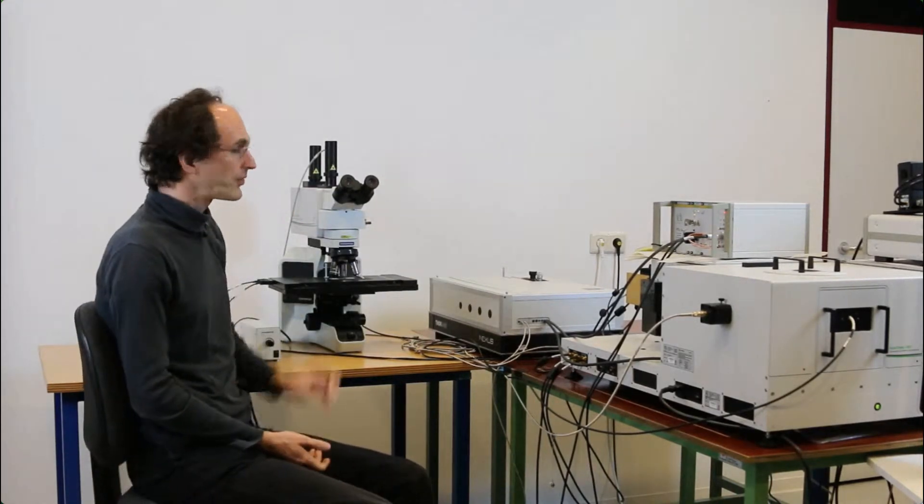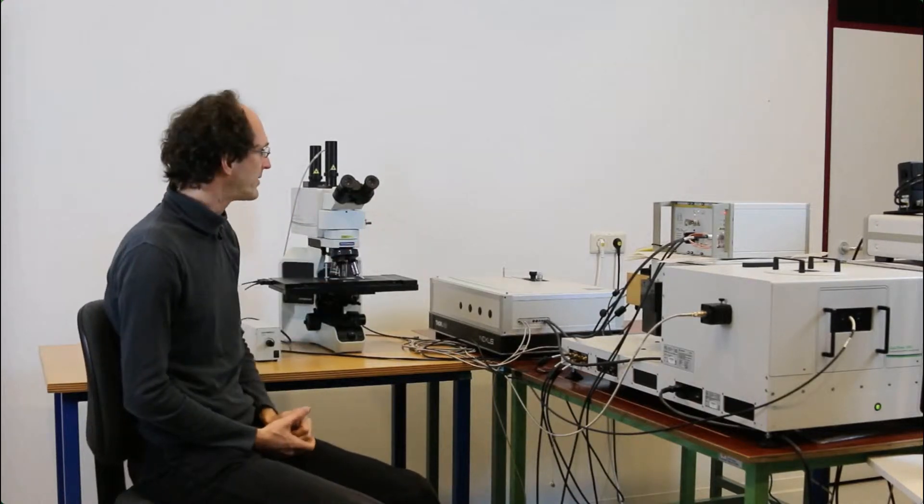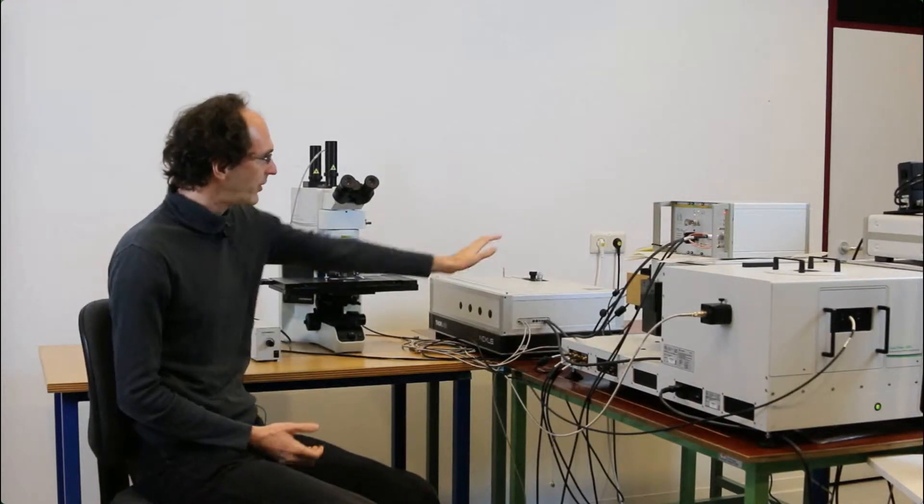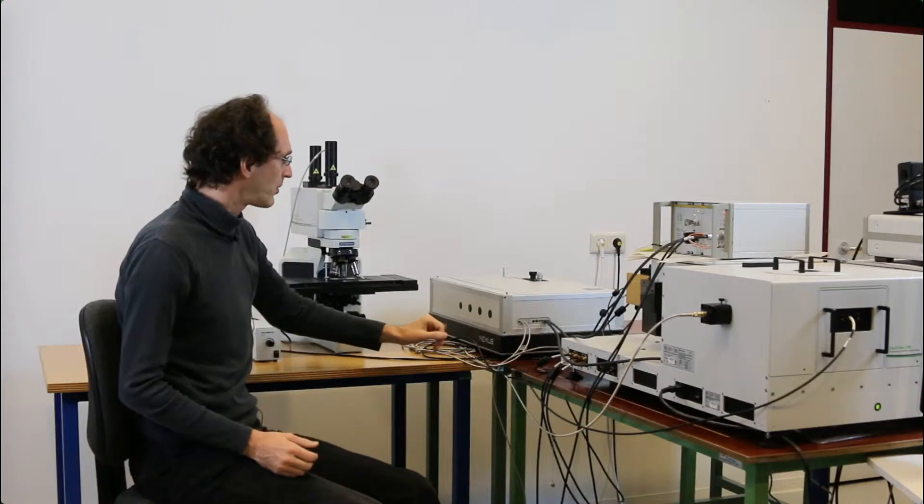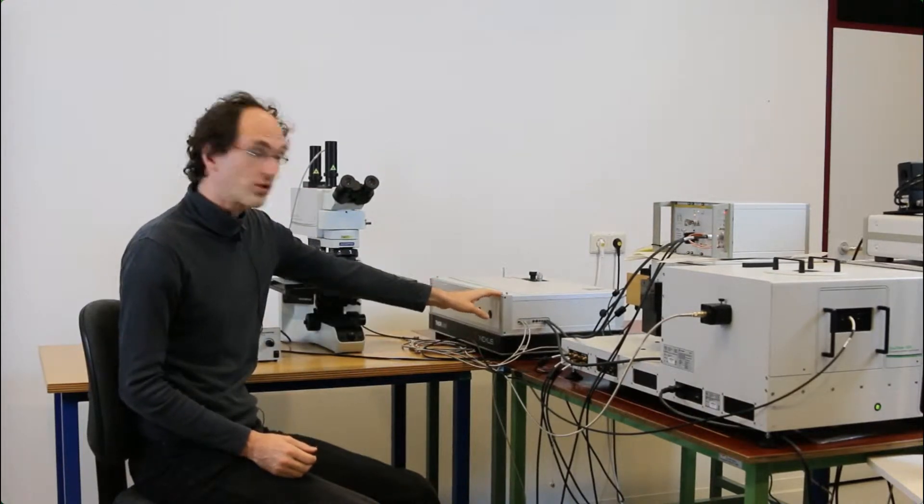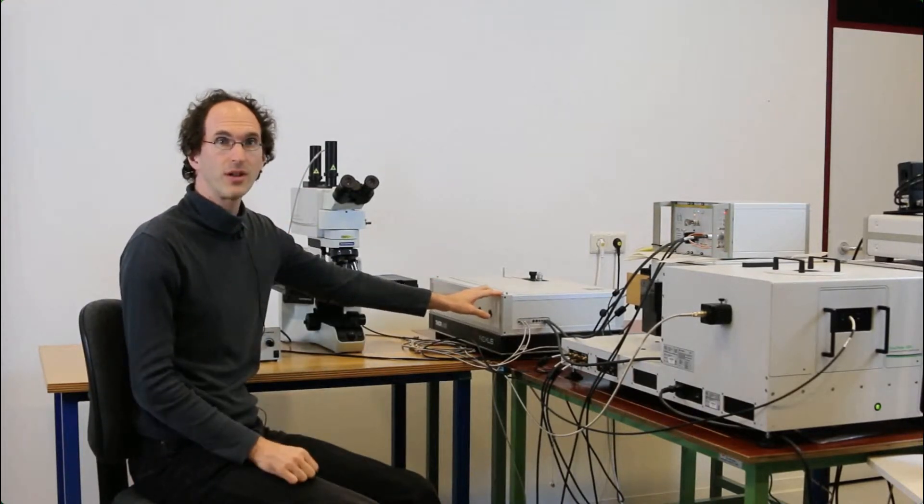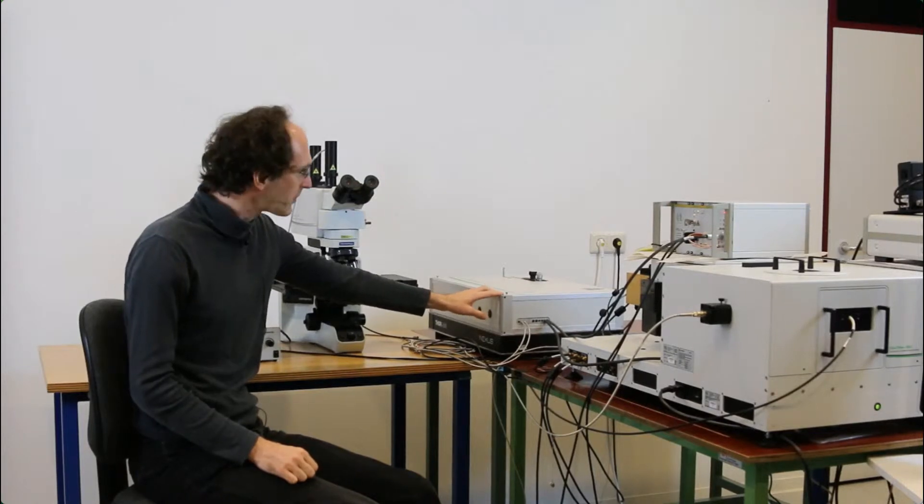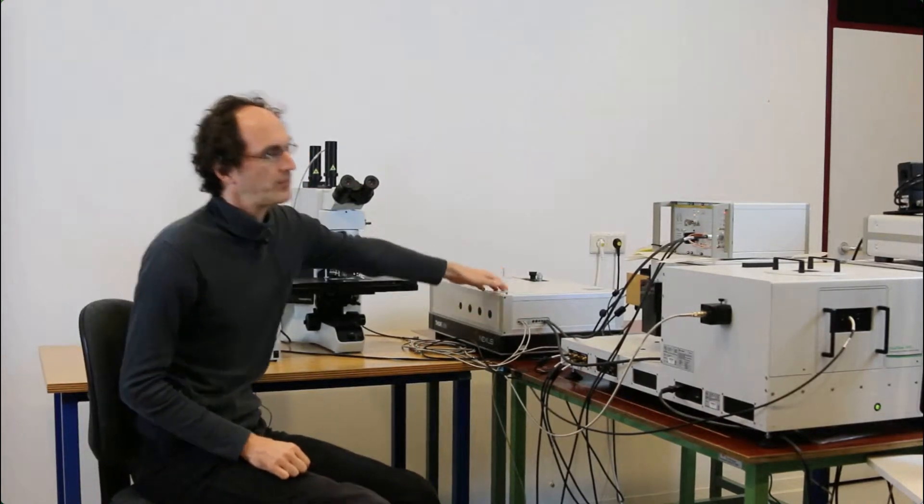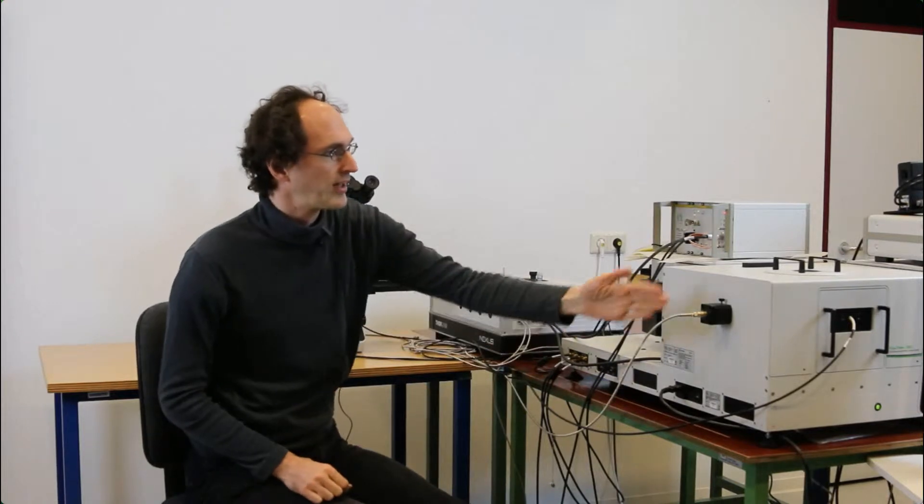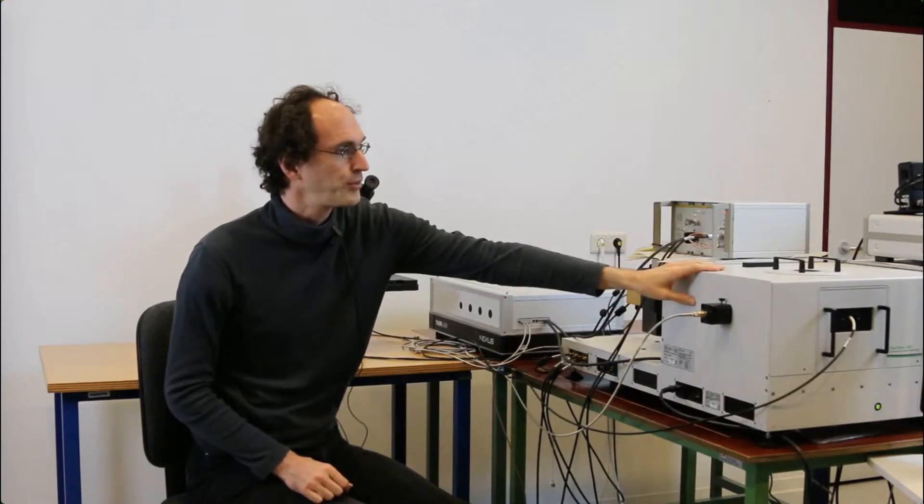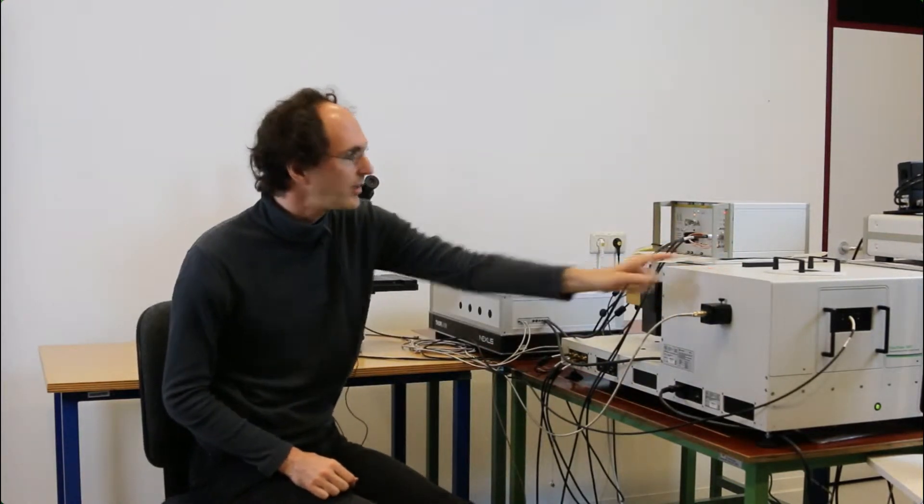The system consists of pulsed lasers, which are in this laser combining unit here. This laser combining unit has two optical fibers that deliver the light to the system. One optical fiber is for measuring in a cuvette, in a classical FluTime measurement, and you get the light here.